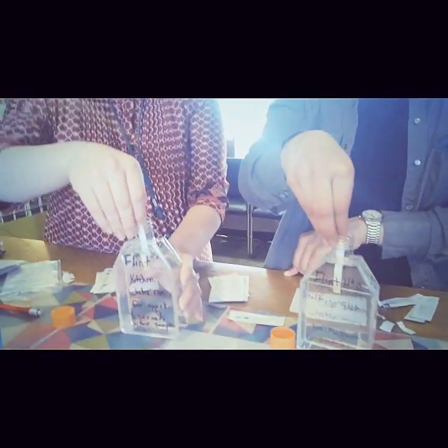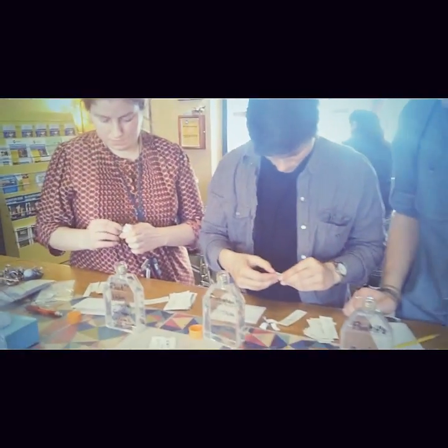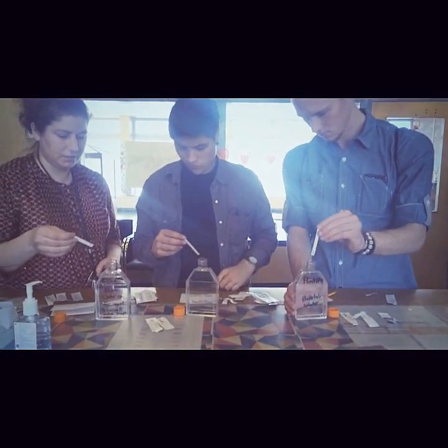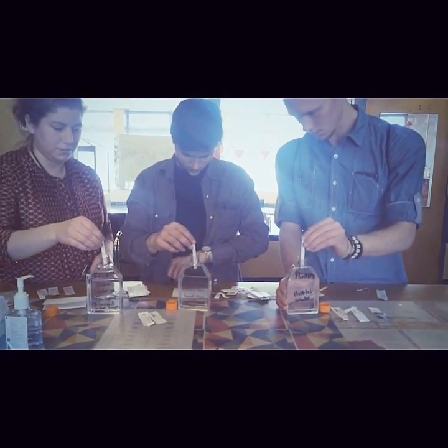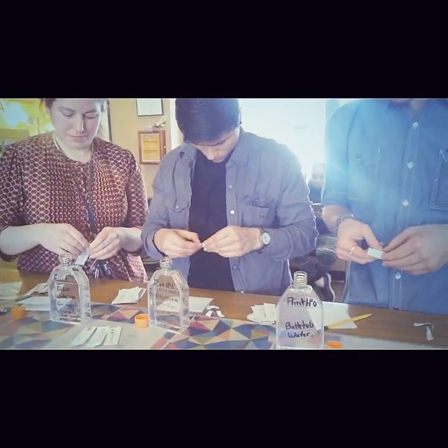Okay, so now we're testing for what? Iron. Okay, this is the third test. What are you testing for now? This one is for copper. And 30 seconds. Okay, you're ready? Test. This is testing for what now?